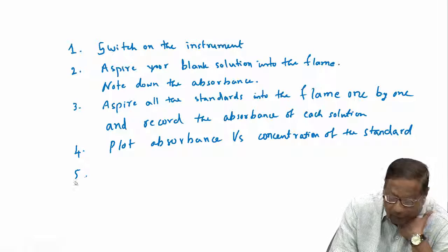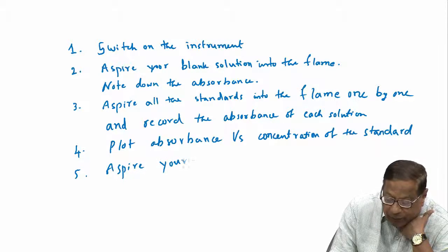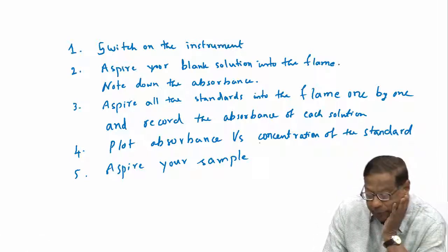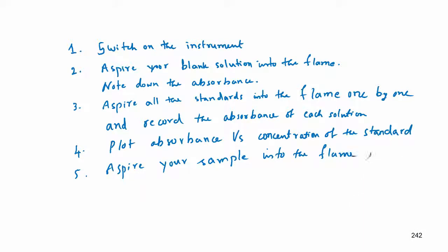Then you aspire your sample into the flame and record the absorbance.